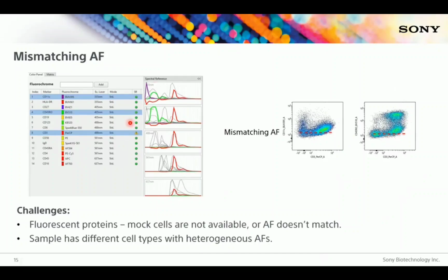If we examine the spectral shape of the PerCP single-stain controls, we notice these negative values, indicating that the autofluorescence subtracted did not match the positive population. This issue arose because the negative population was gated on cells, while the positive control was prepared using beads. We need to match them.